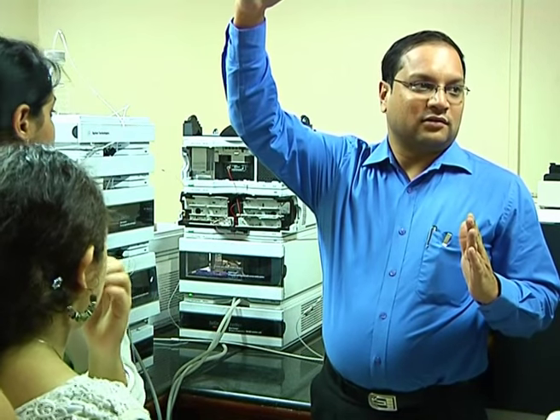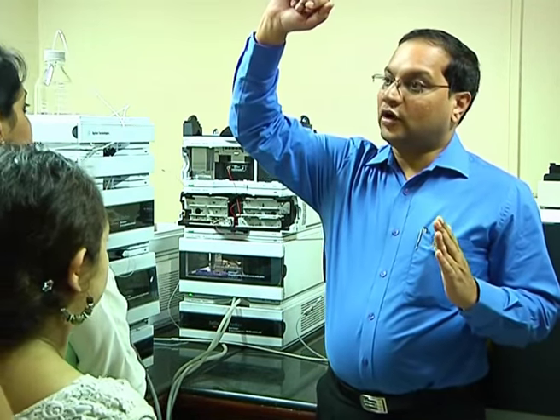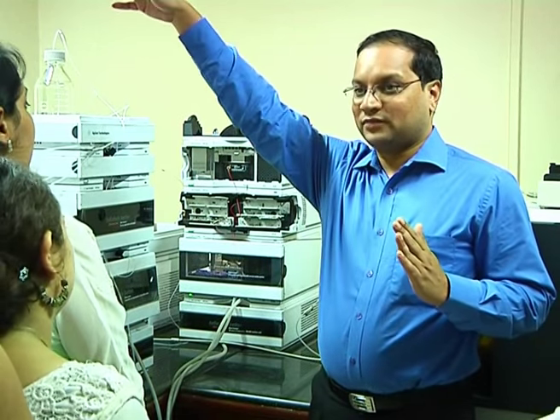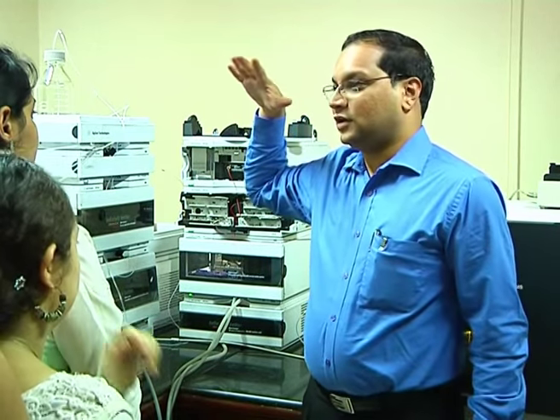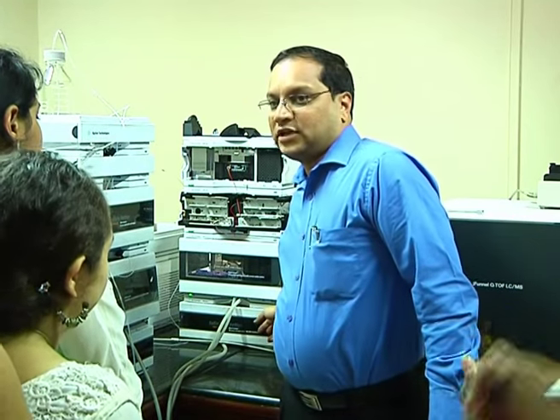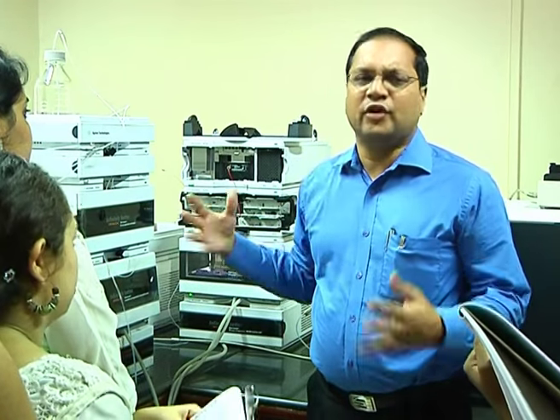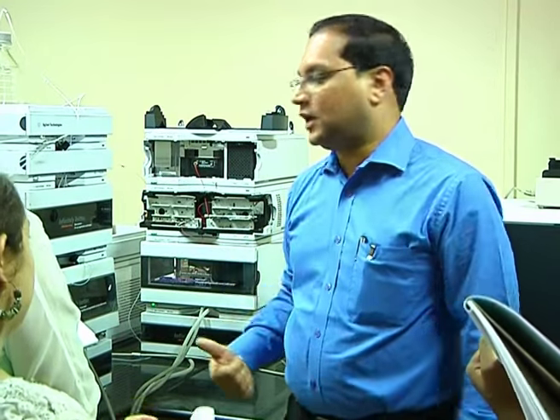Or more than that. What it means is samples might degrade by the time their number comes. So to maintain a constant temperature, you have a thermostat. You maintain the temperature of the samples in the autosampler at 4 degrees, so that your sample doesn't degrade during the automated analysis.